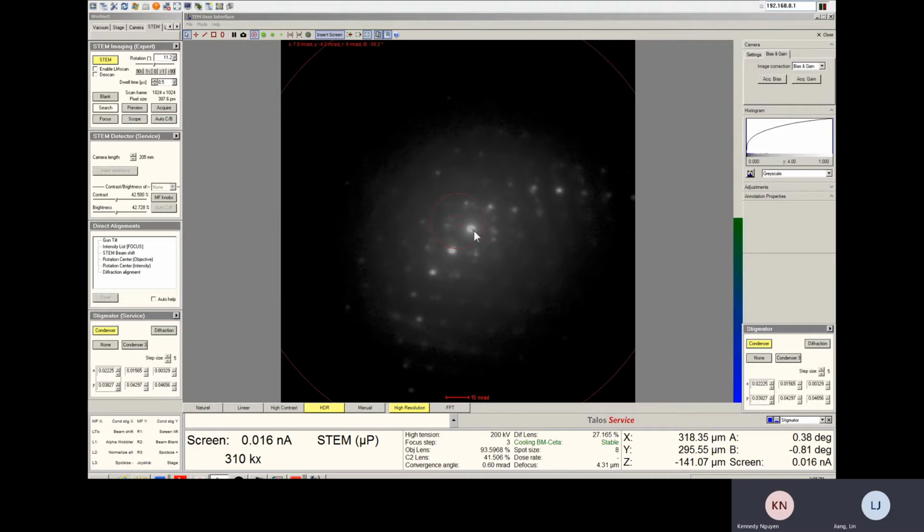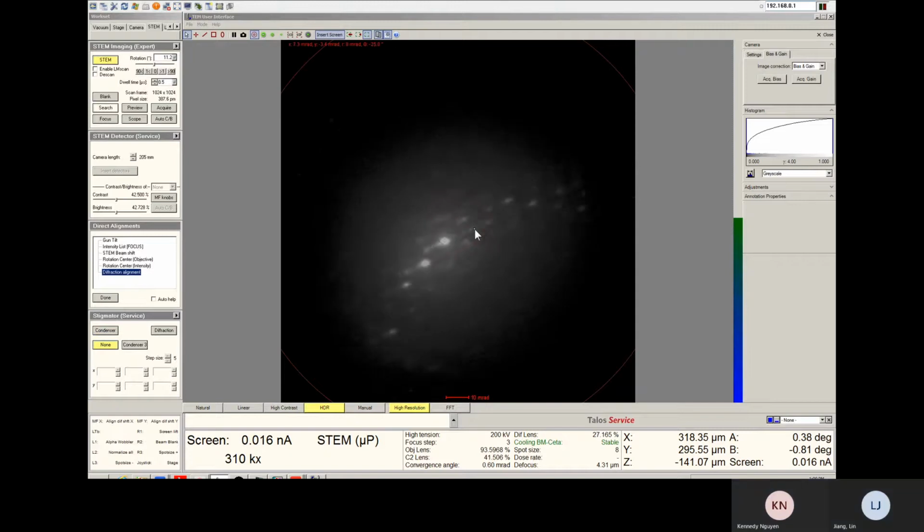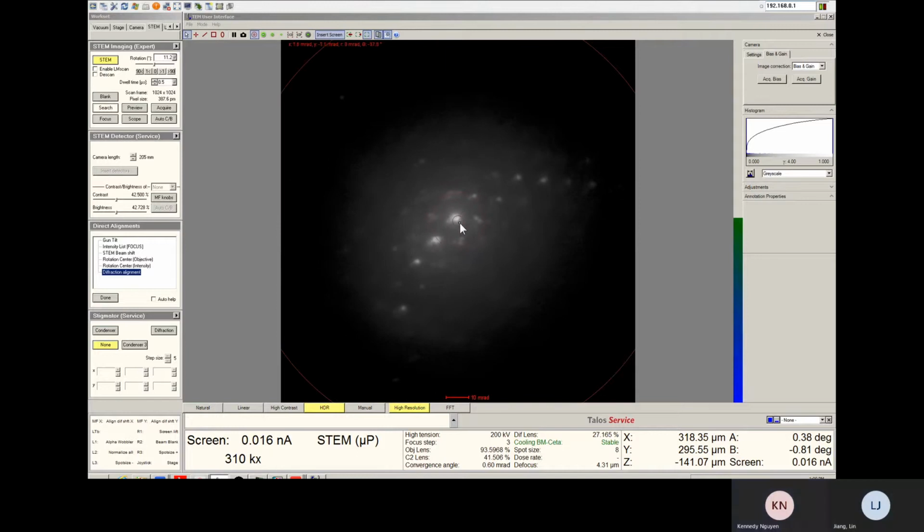Yeah. Okay. Let's center this. Right, to the middle. Get the bright spot in the center.